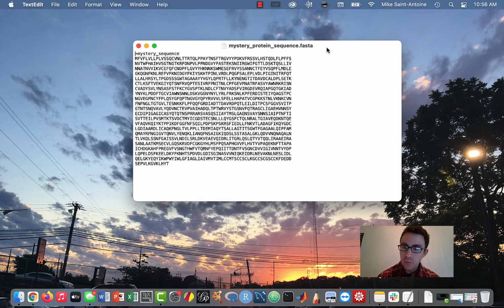And it's pretty cool too, because in a lot of other fields like experimental biology or physics or chemistry, doing research requires a lot of very expensive equipment and expensive physical material. But if you're working on bioinformatics research, a lot of the research you can do involves free tools that are available online for anyone to use. And today I'm going to be showing you how to use one of those free online tools to do some cool sequence analysis research for a protein sequence. Okay, so let's get started.